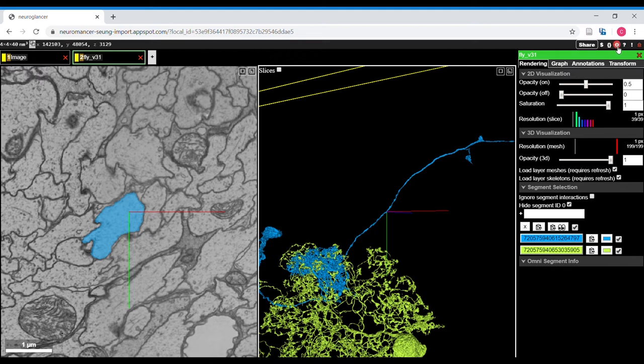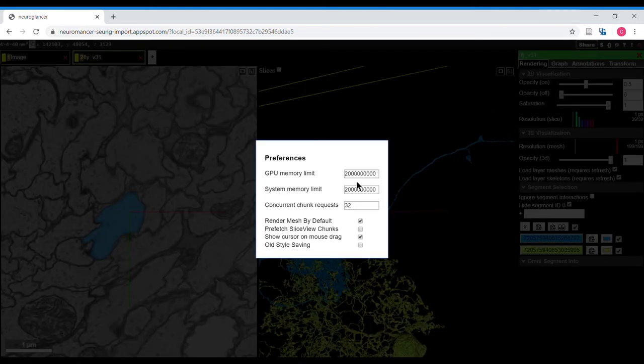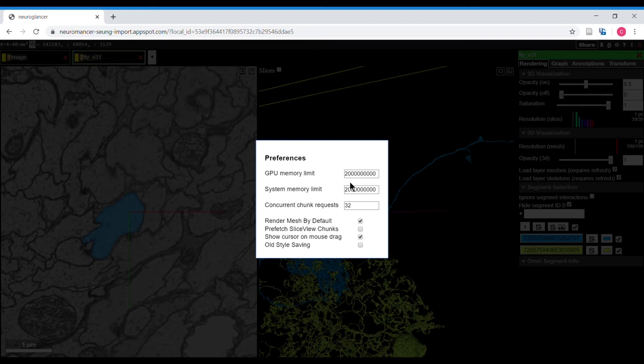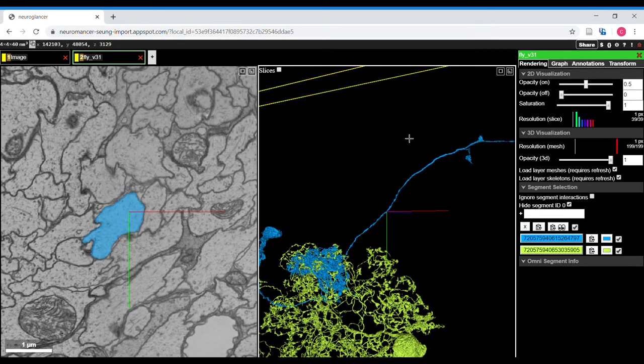Up here, the gear icon shows preferences. And if you're having display problems, you can try increasing or decreasing the two memory limits. Hit escape to get out of that.